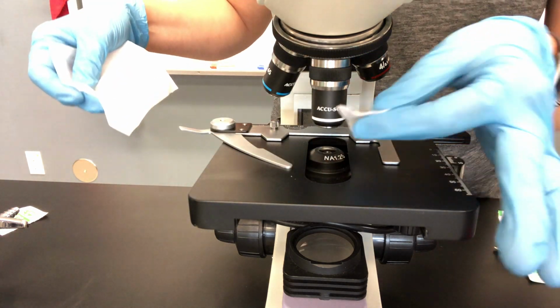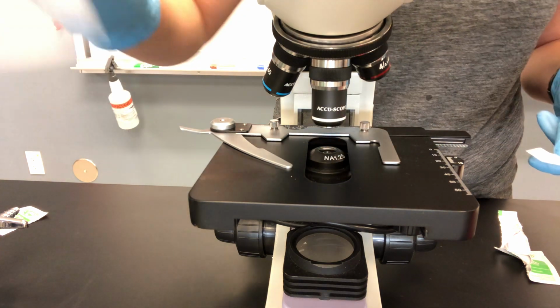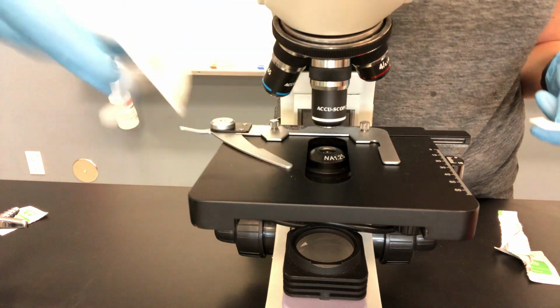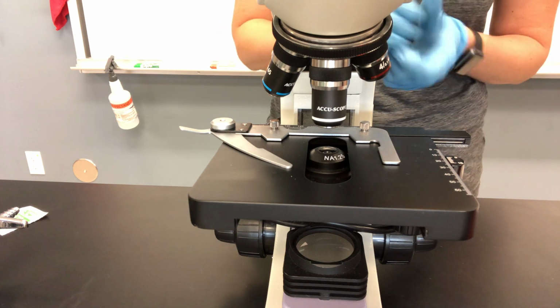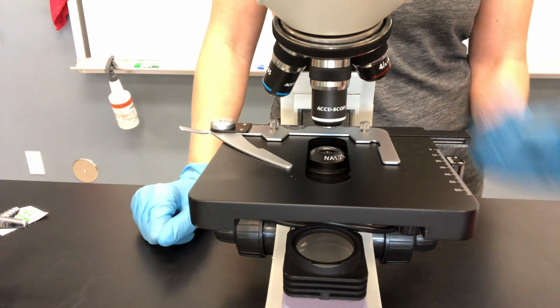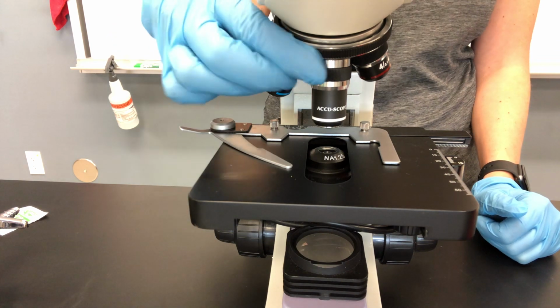Then you take your alcohol swab and you just kind of wipe that clean to make sure you have all of the oil off. And then with your clean lens paper, you just dry that objective, because everybody's gonna sign out their own microscopes. So you have to take care of your microscope all term, because that's what you're gonna use for your unknown project, that's what you're gonna use for your practicum. So you wanna make sure that you're gonna take good care of your microscope. And so if everybody's doing that, everybody will have a great microscope experience.